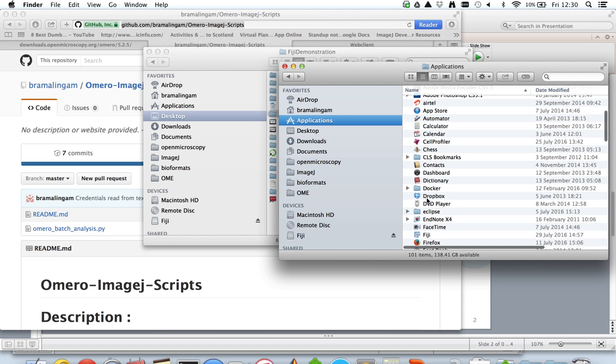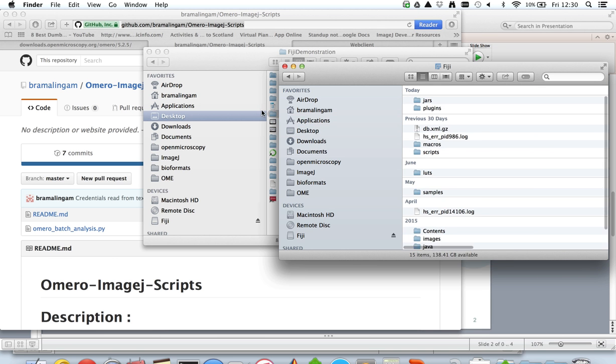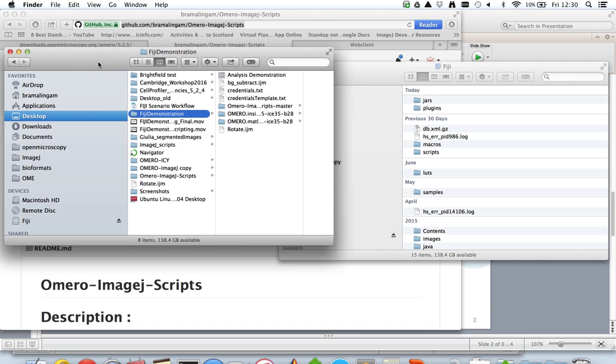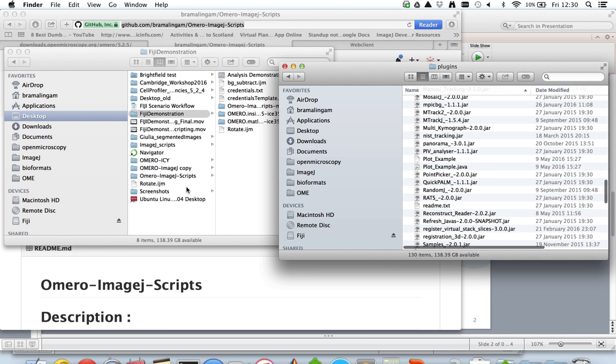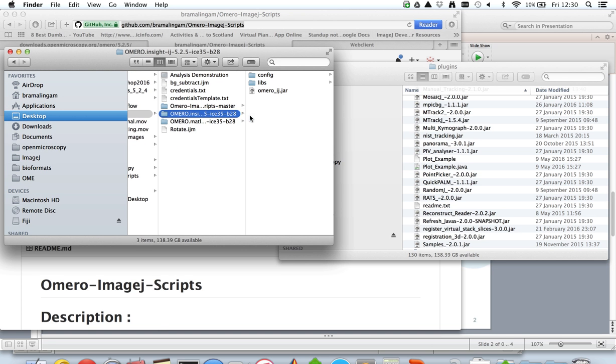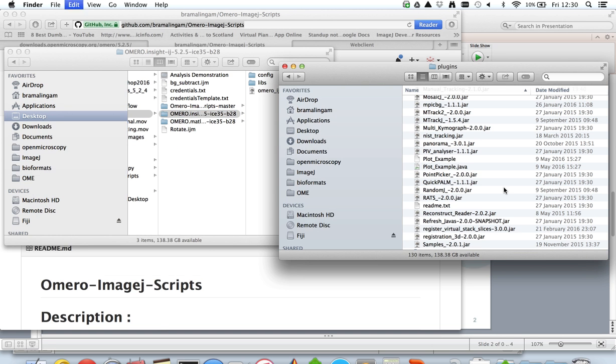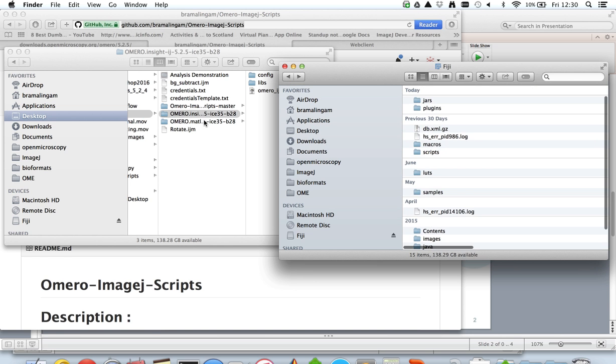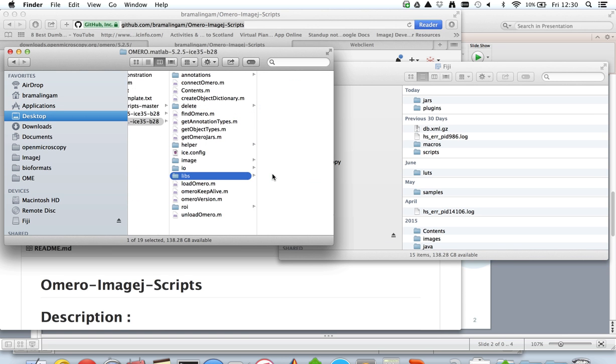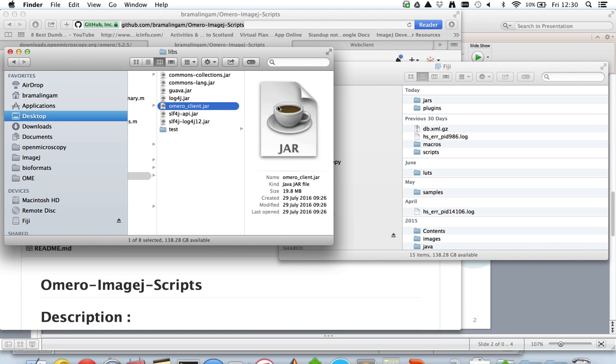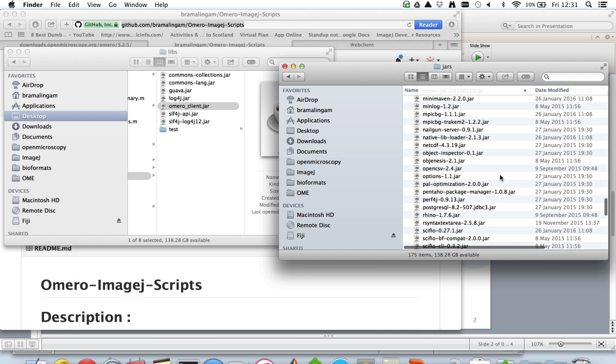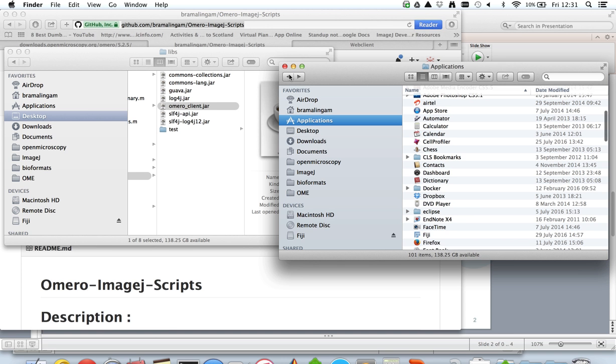Applications, Fiji, show package contents. Now the first part is the installation of the OMERO client.jar under Fiji jars folder. That completes the setup process because Bio-Formats is pre-installed in Fiji.